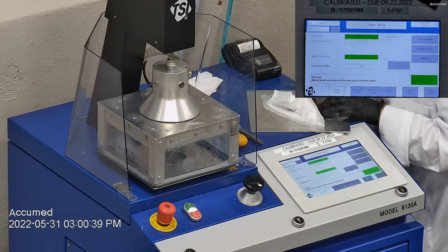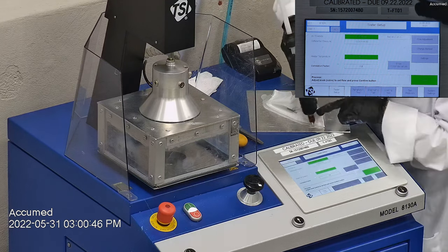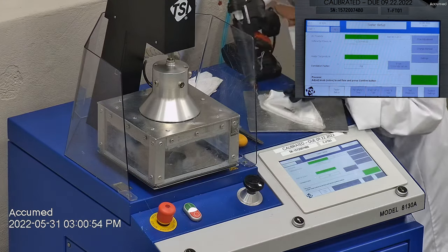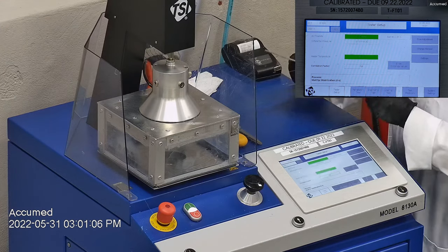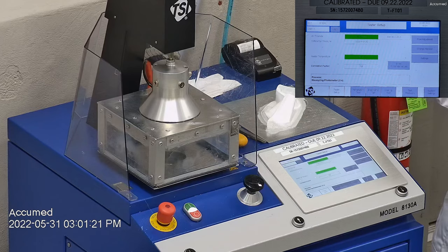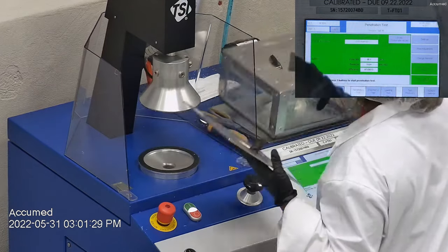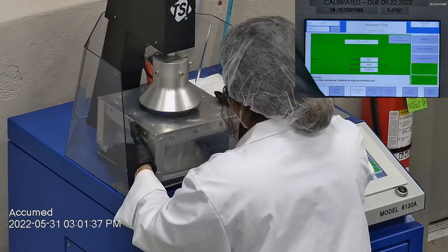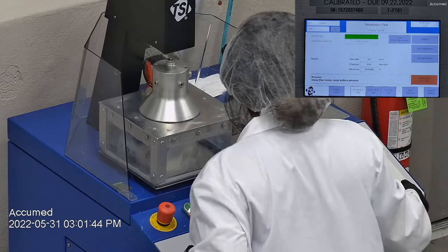The results are displayed on the TSI monitor. F stands for air flow rate, which we test at 85 liters per minute. R is for resistance, also referred to as pressure drop. This correlates with the breathability, so the lower the number, the more comfortable and breathable the mask is. E stands for filtration efficiency percentage.